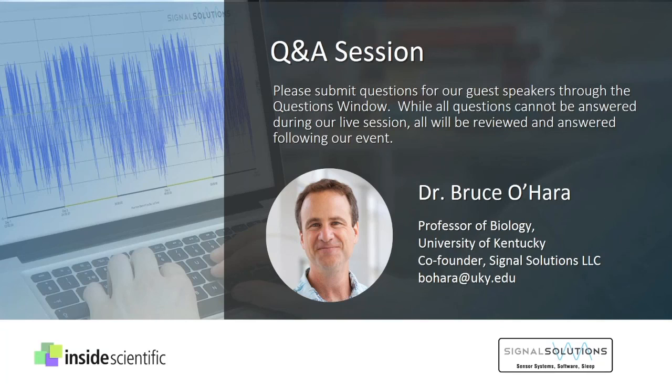Can data be monitored remotely while an experiment is ongoing? In other words, does somebody need to be in the lab operating this, and obviously one doesn't want to disrupt the animal, so how would one go about doing that? Yeah, as long as the animal rooms have internet. Some of the older animal rooms don't, but you can always get a wire in there if you really push them, or a wireless system, in my experience. So as long as there's internet capability in the animal facility, you can monitor this from anywhere.